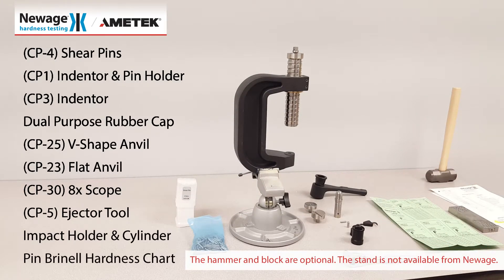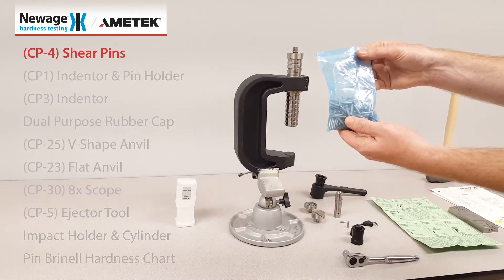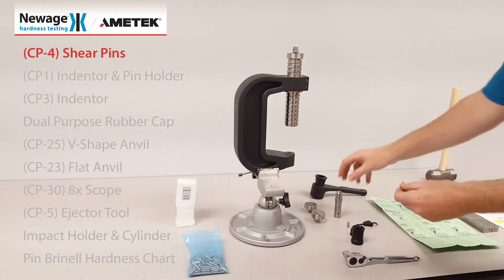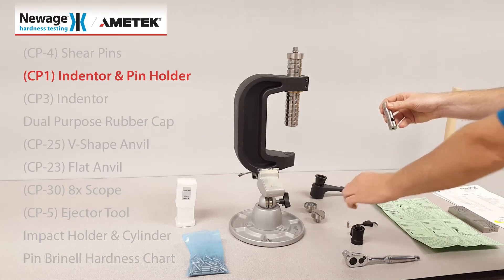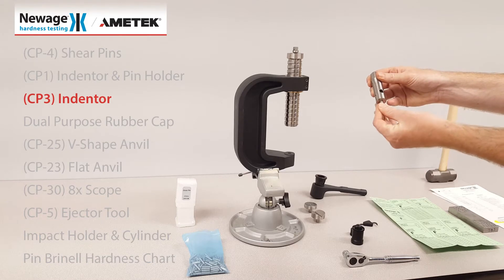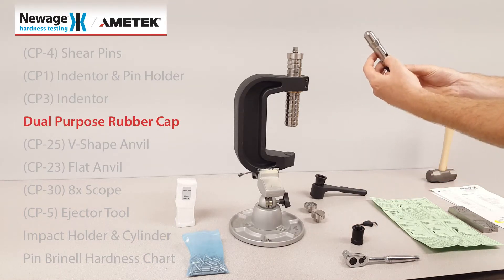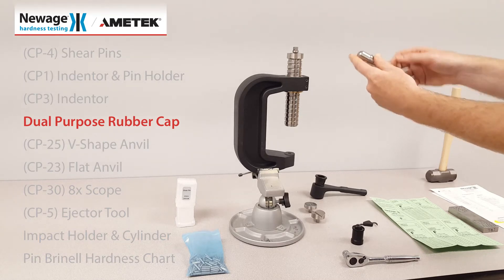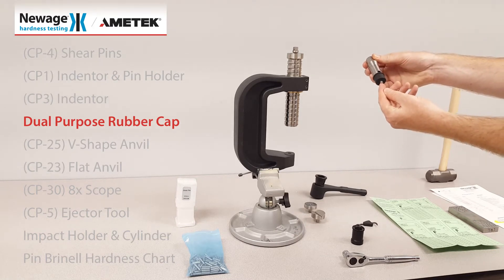We will begin with the bag of 250 consumable shear pins. Insert the pin into the indenter holder. The regular indenter is inserted in the bottom of the indenter holder. Provided is a rubber cap that serves two purposes: it holds the shear pin in place when the test is performed, and it also holds the indenter in place.